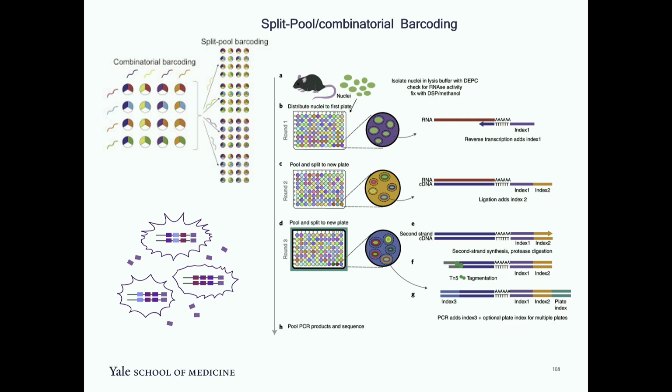So, basically what you are doing, each of these cells will have a set of 4 barcodes, and this one also has 4, but you see the order of each of these barcodes is different. So it is the combination of barcodes, and also the order of those barcodes is different. This way you can create any number of combinations just by splitting and pooling.